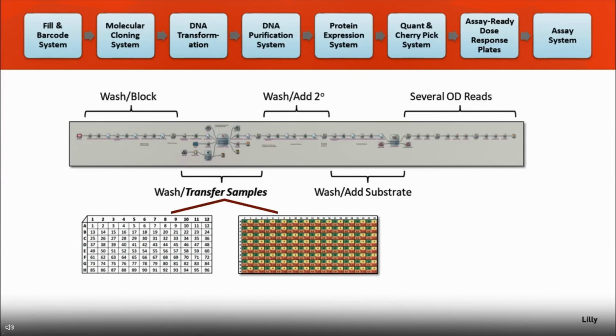You have a ballpark, based on the scientists we're working with, of how long development should take, but since we have all the plates on there in an automated fashion, we can read from just a few minutes out to some of the plates we've read at 18 plus hours. So it's nice to essentially queue up the system and let it go until these plates saturate, and then we back off and go to the time point or a couple time points before that, to get good exposure without saturating.